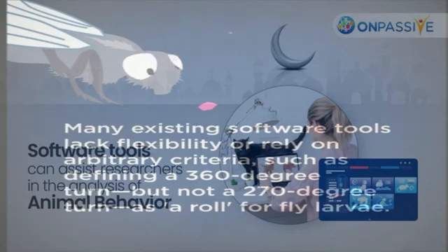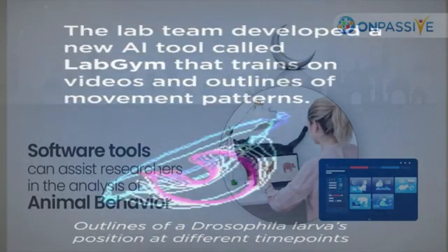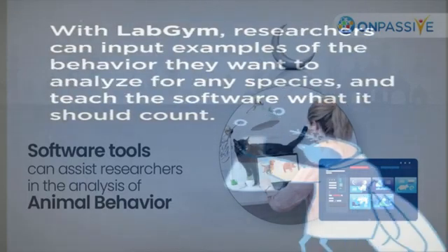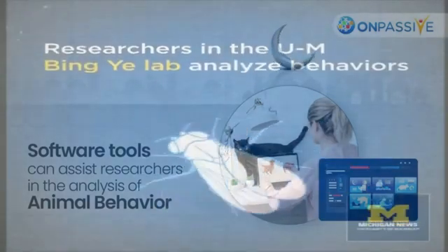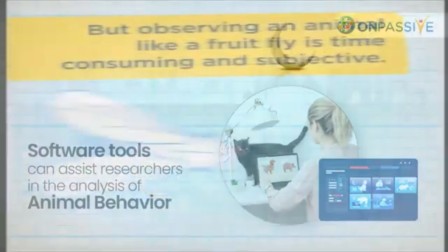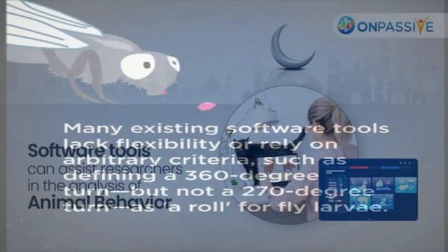The researchers discovered that integrating video data with pattern images improved the program's accuracy in distinguishing different forms of behavior. LabGym is also meant to ignore unnecessary background information and focus on the animal's general movement as well as changes in location over space and time, just like a human researcher would. The application can also track many animals at the same time.